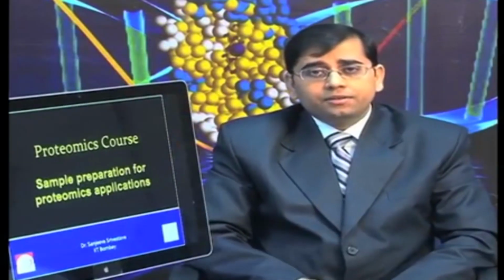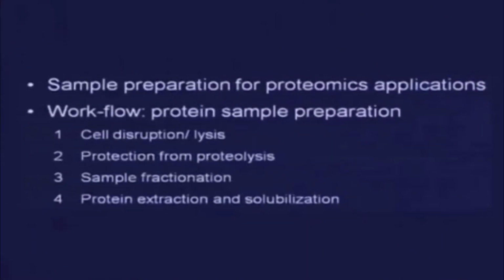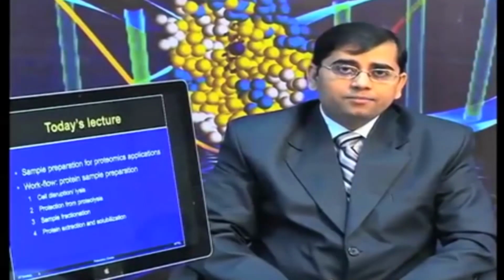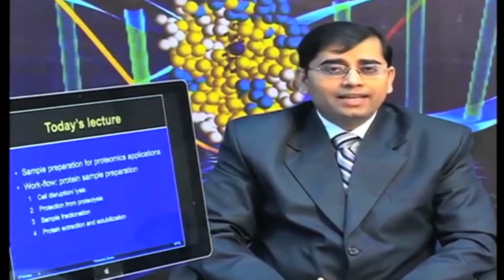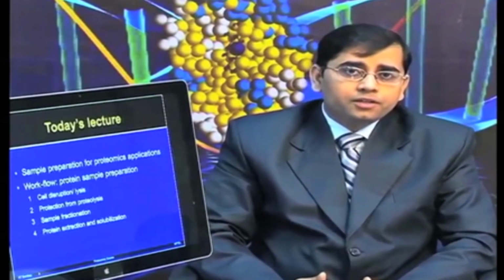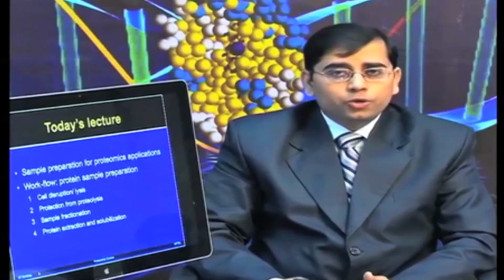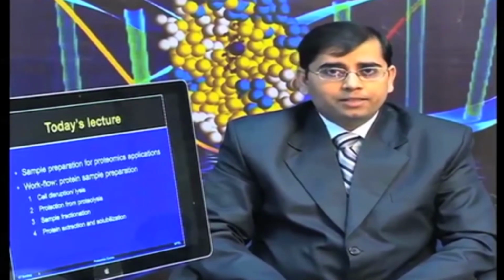In today's lecture, I will give you a workflow for protein sample preparation: the first step, how to disrupt the cell, how to lyse them, how to protect the cells during the lysis step so that there is no proteolysis occurring, and how to fractionate the samples.